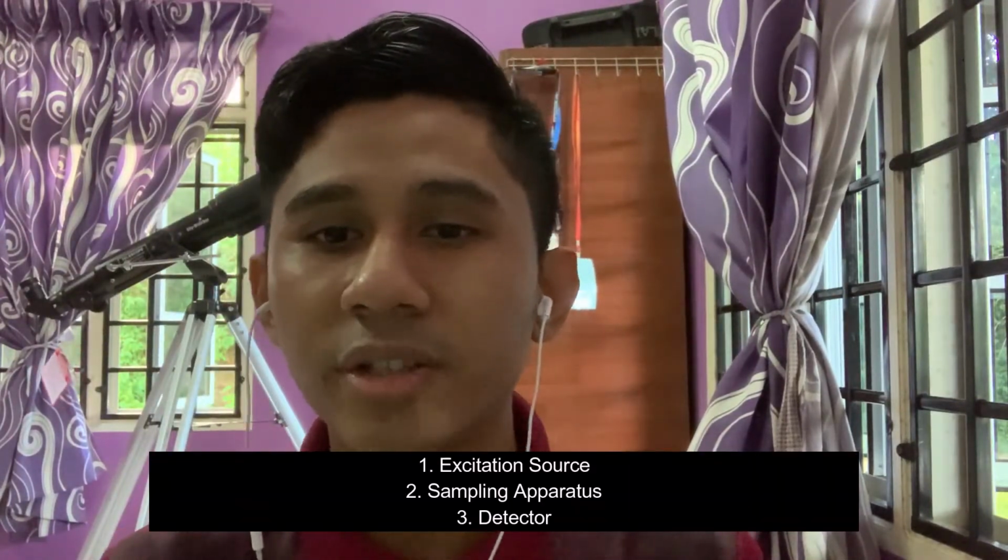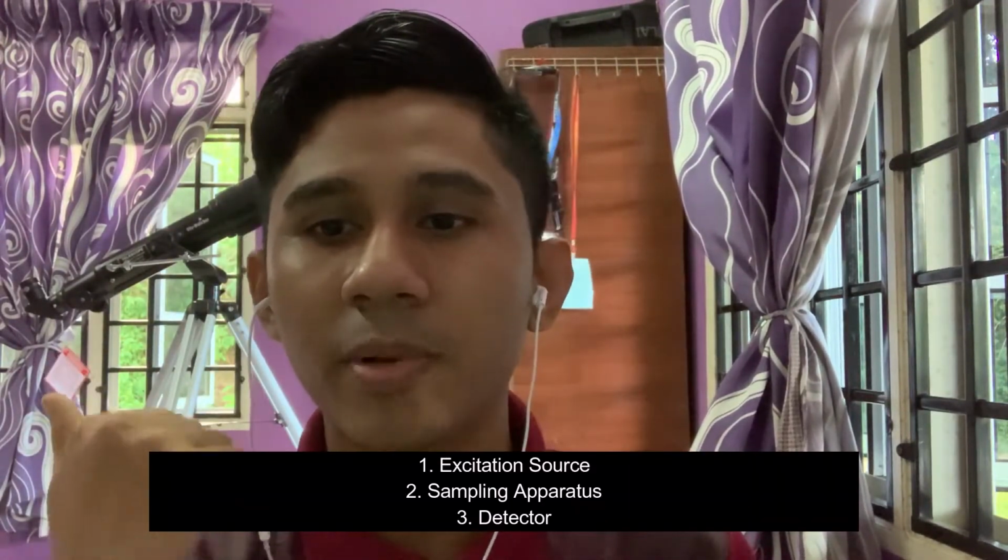So generally, there are three primary components for any Raman spectrometer, which are the excitation source, the sampling apparatus and a detector.